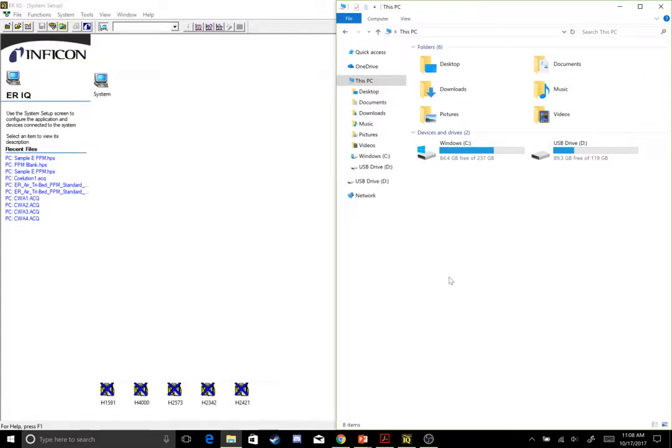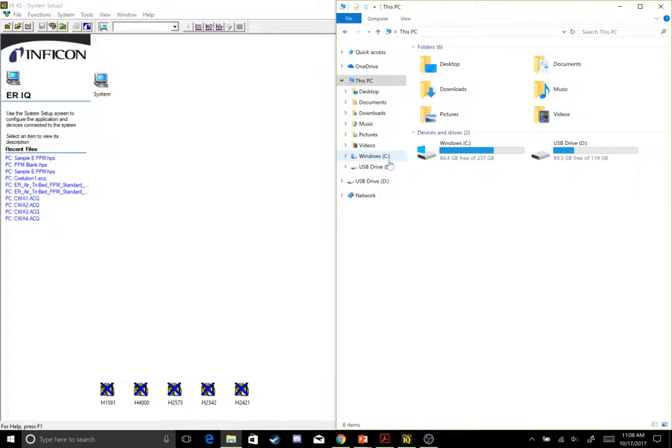Today we're going to go over setting up your NIST and AMDIS libraries on your HapSite ERIQ software. The first thing you need to do is locate your NIST library and place it into your ERIQ folder on the C drive.